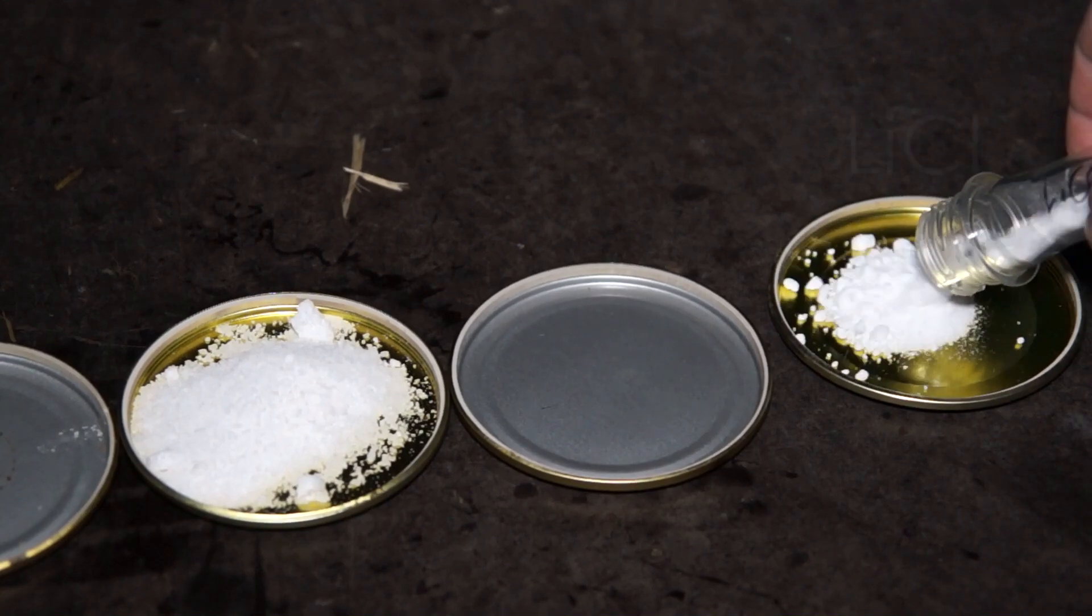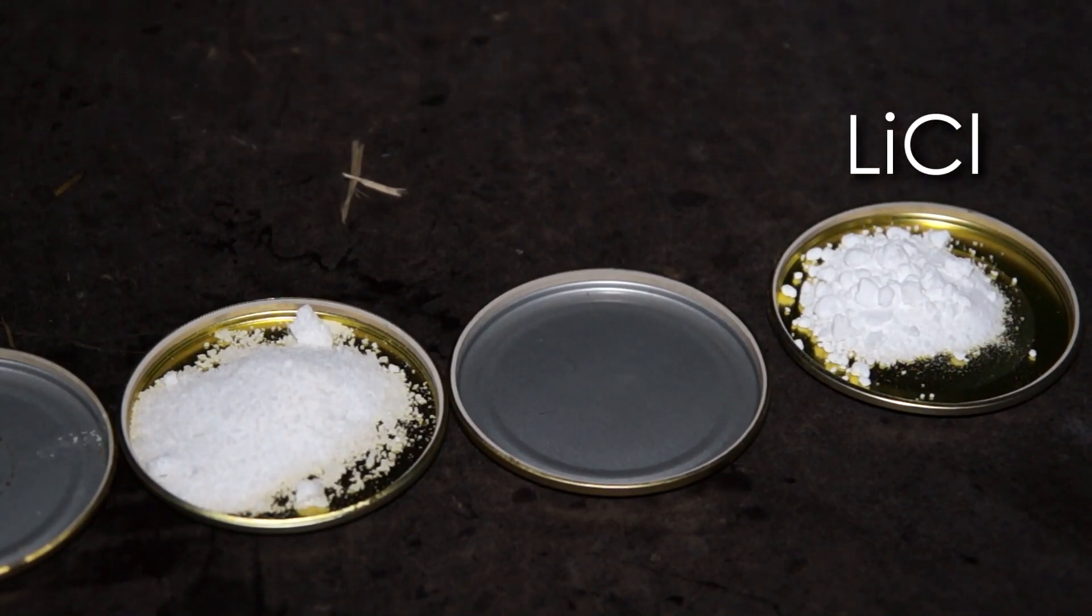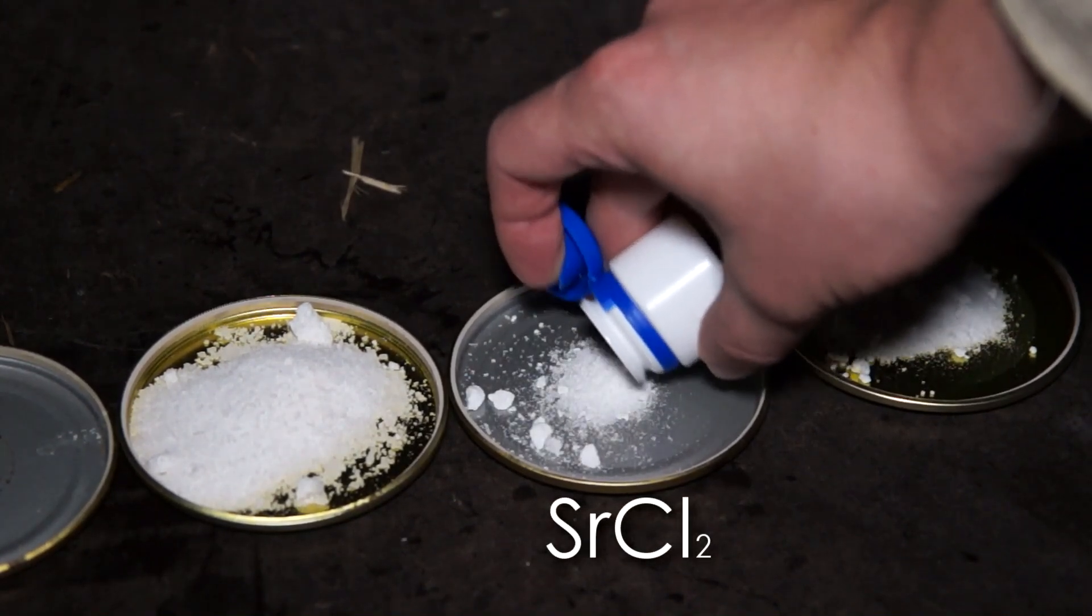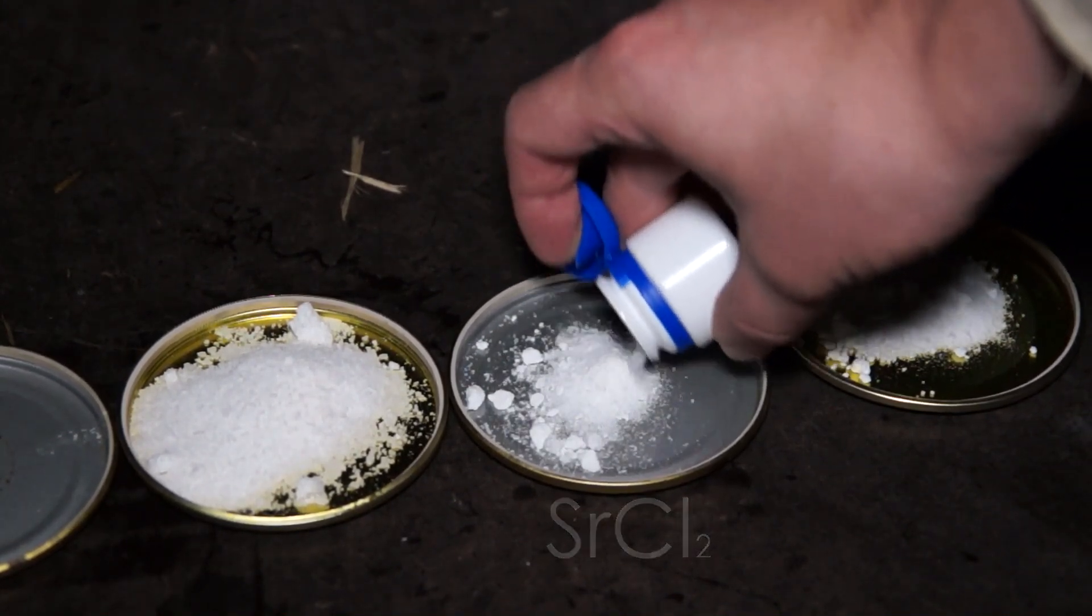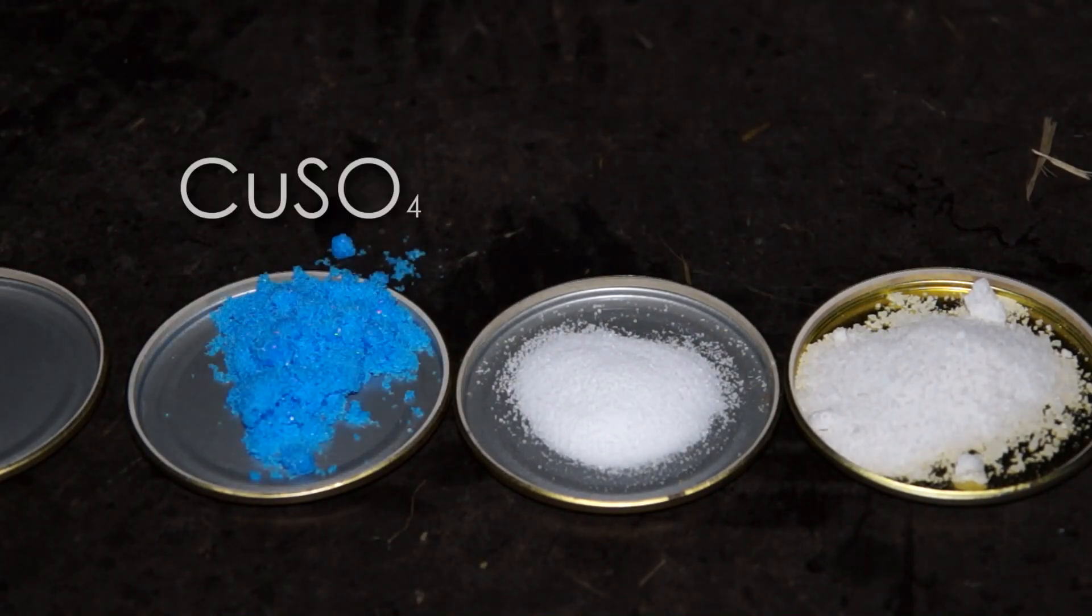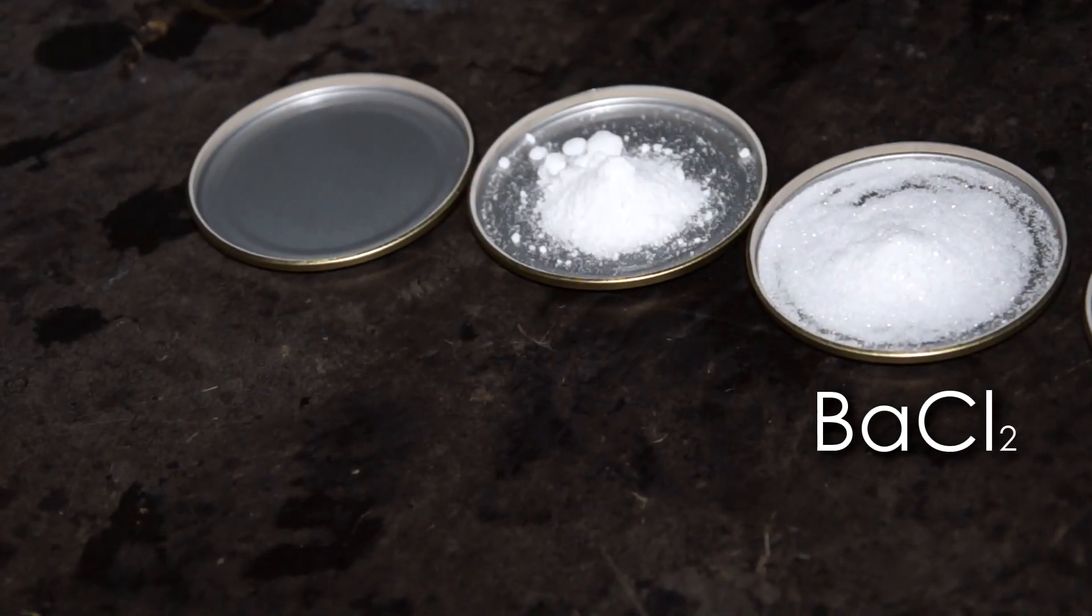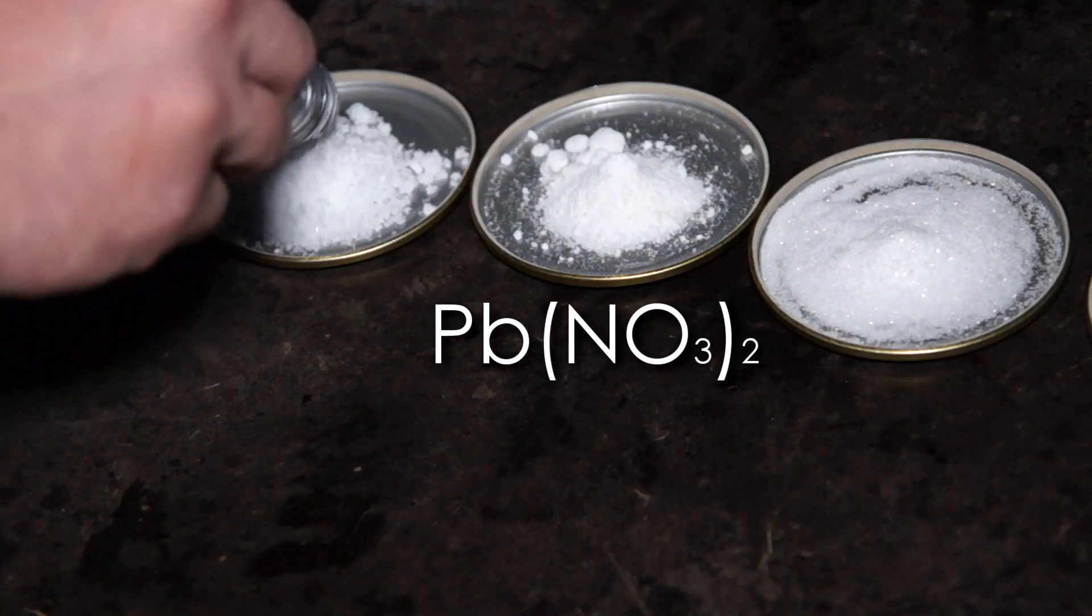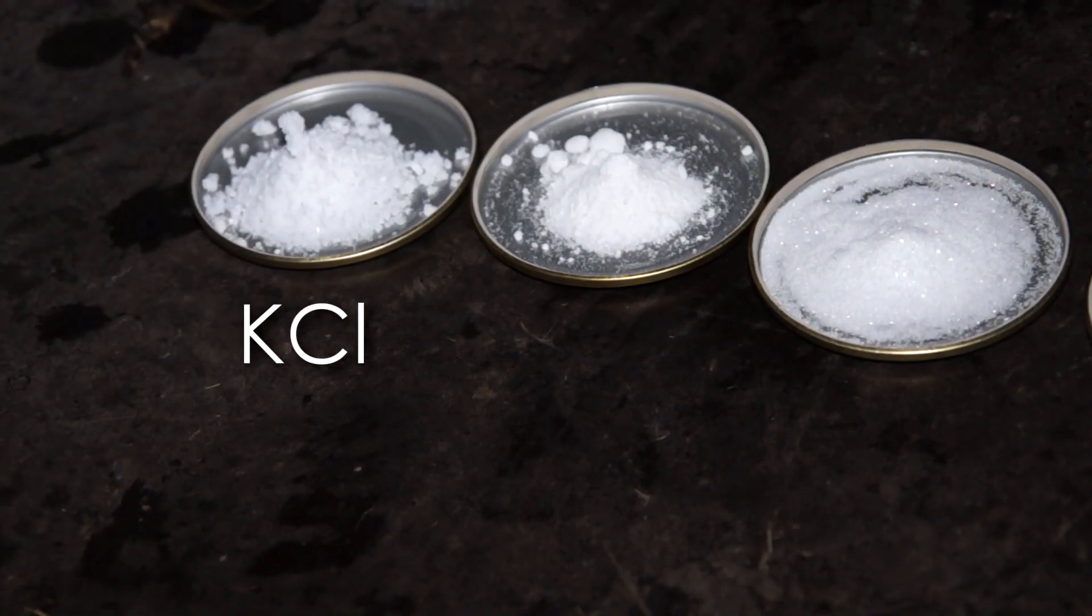The next one is lithium chloride which I pour in the first cup. It will paint the flame in red carmine color. Then I pour strontium chloride. Next substance is boric acid. After is bluestone. Then I pour barium chloride. Next goes lead nitrate and in the end potassium chloride.